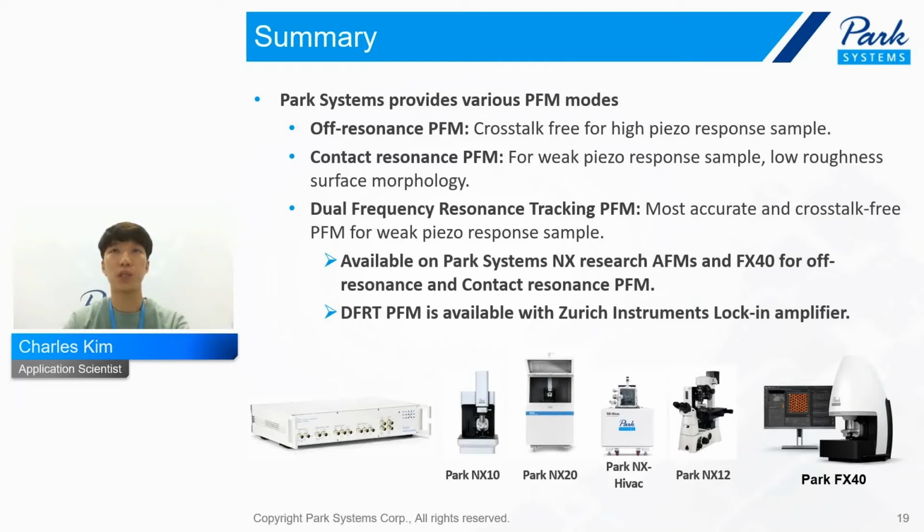The off resonance mode is good for high piezo samples. In the case of weak piezo response samples, we need to use contact resonance PFM. But the contact resonance changes depending on the surface morphology, so it's only good for low roughness surface samples.